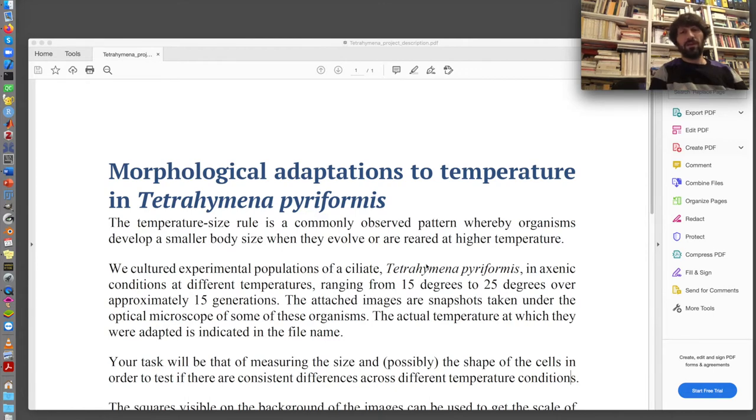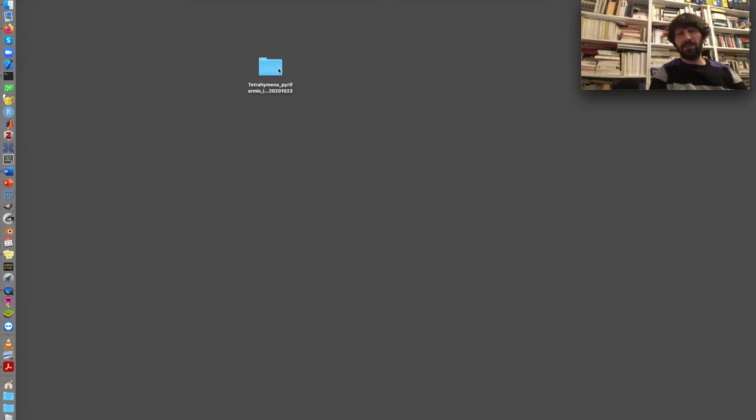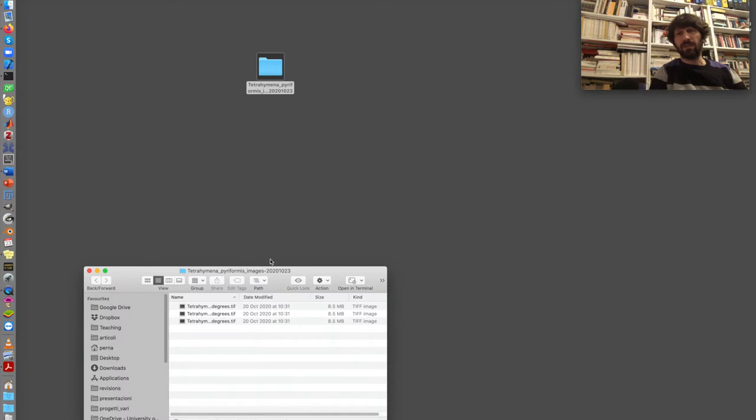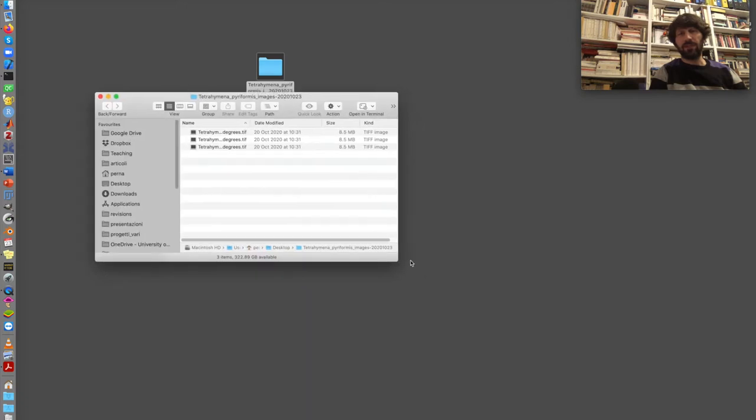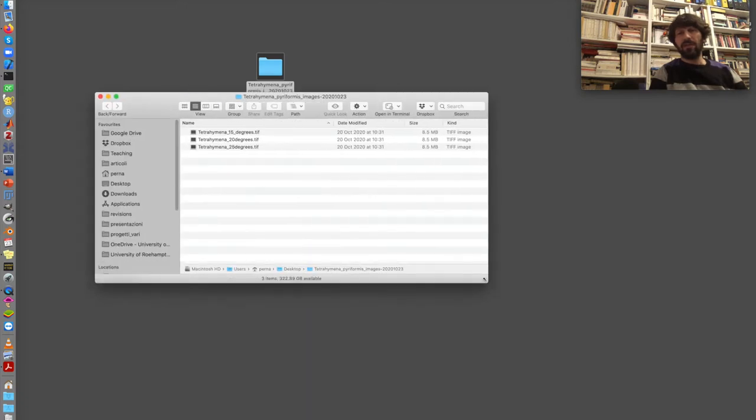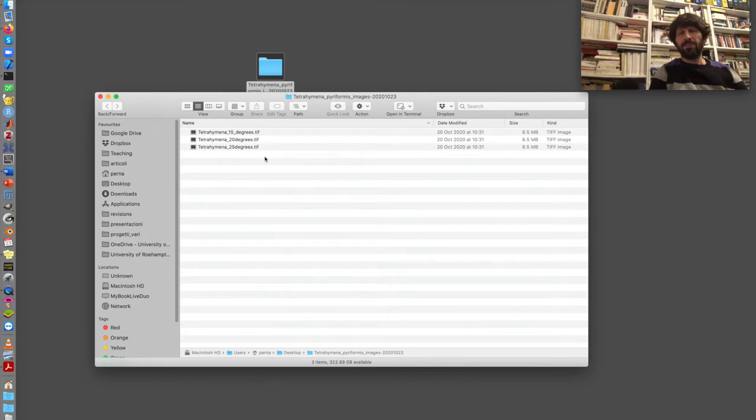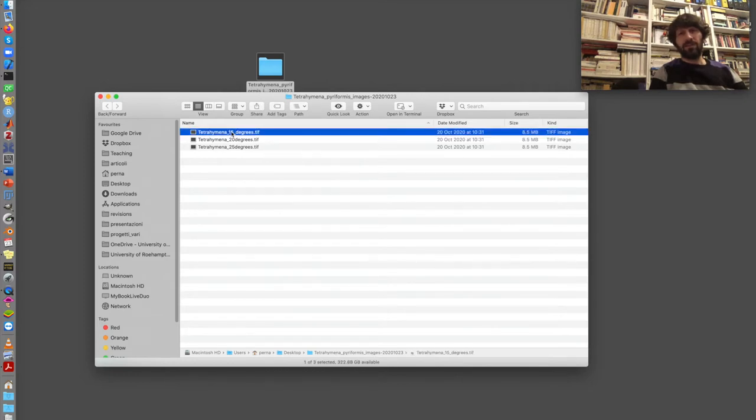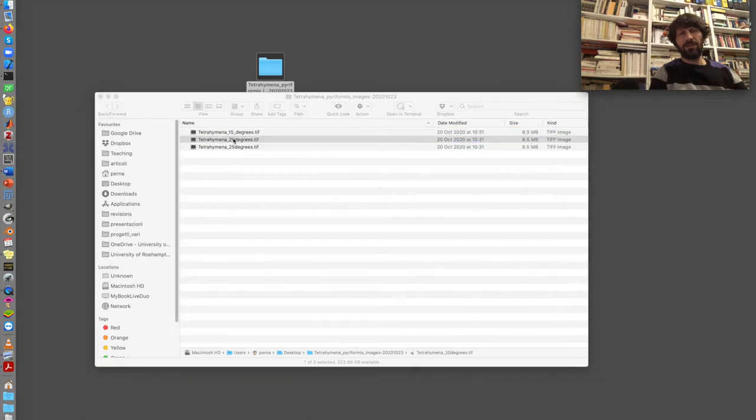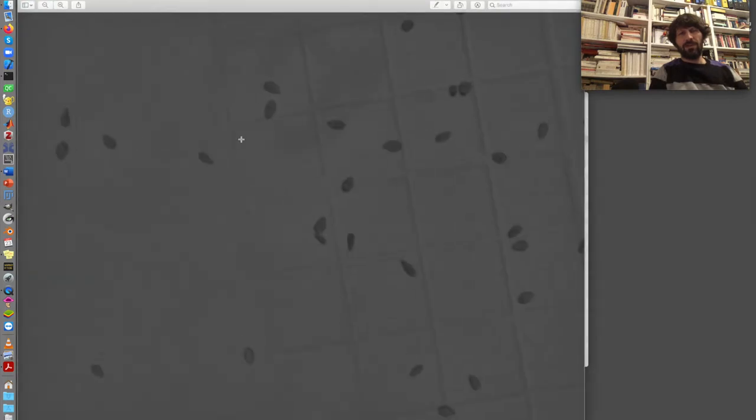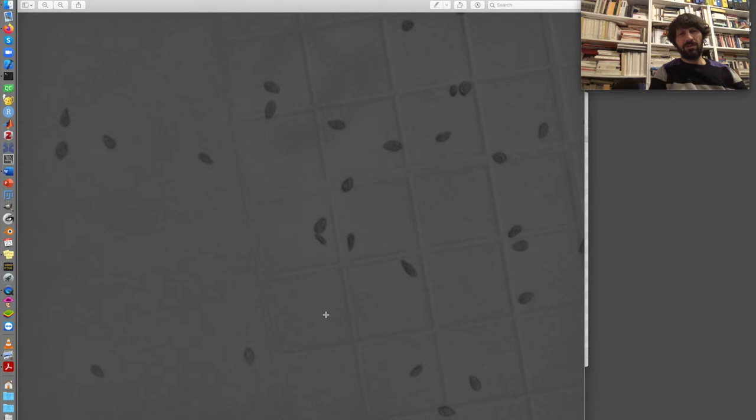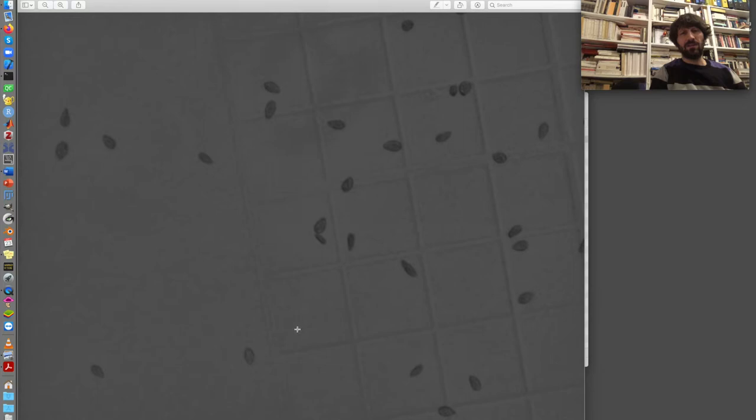In a series of experiments we made Tetrahymena piriformis, which is a small ciliate about 50 micrometers in length, grow for 15 generations approximately at different temperatures: at 15, 20 or 25 degrees. At the end of this adaptation process we took some pictures under the microscope where we can clearly see the Tetrahymenas and we can see also on the microscope slide this grid which gives us the scale of the image. Four squares in this grid correspond to one millimeter.